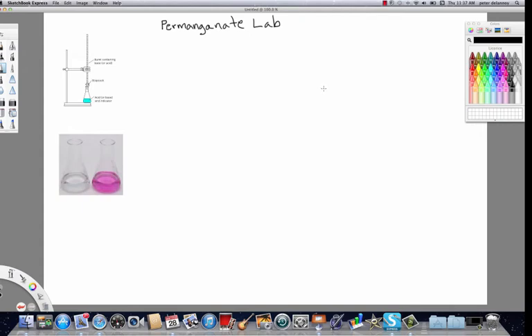Okay, in the last few videos on the playlist that deals with solution redox reactions, we learned how to balance those reactions. And now I would like to teach you about the classic permanganate laboratory. This is a lab that happens in most general chemistry classes at the college level, and it's one of the classic labs that occurs in the advanced placement chemistry classes.